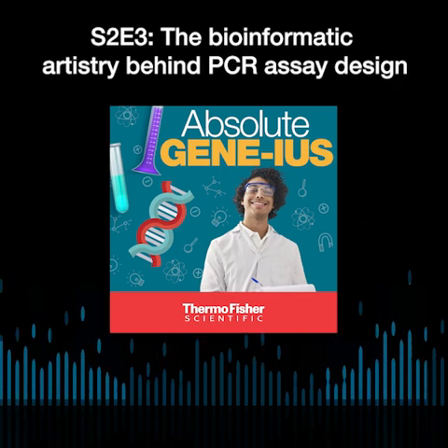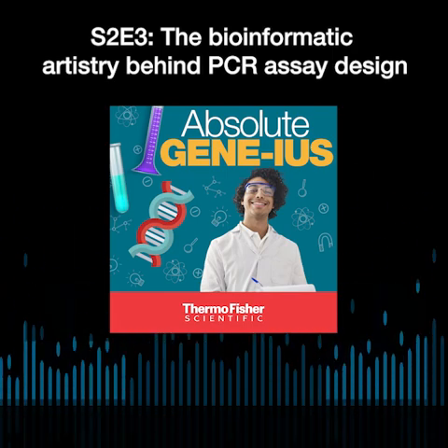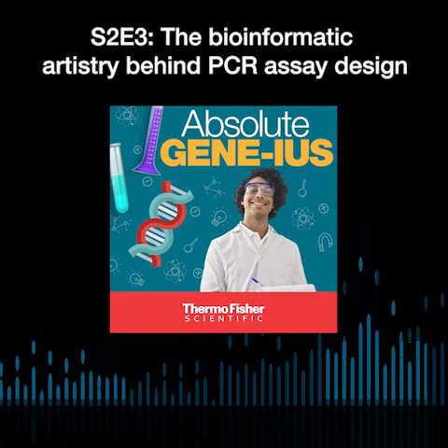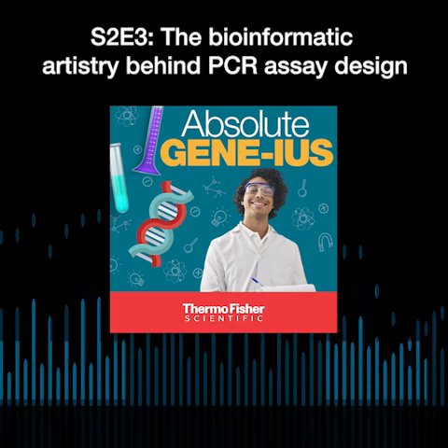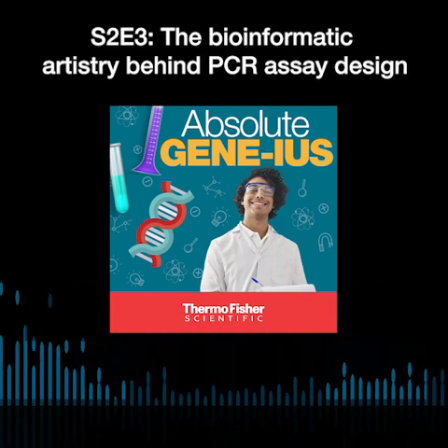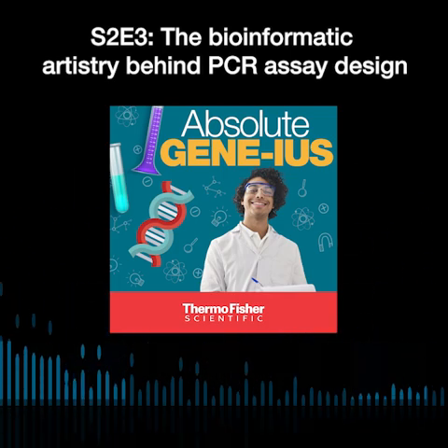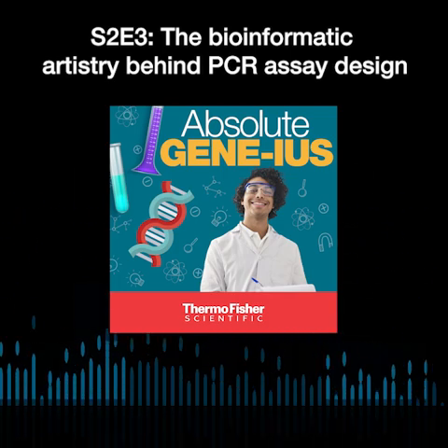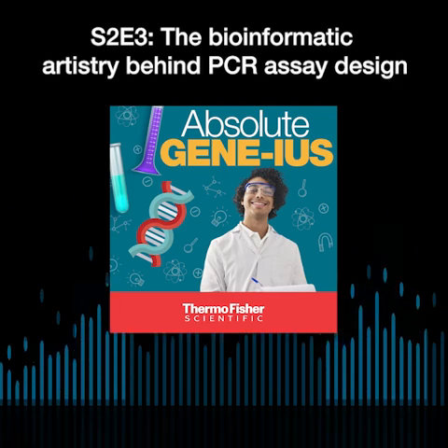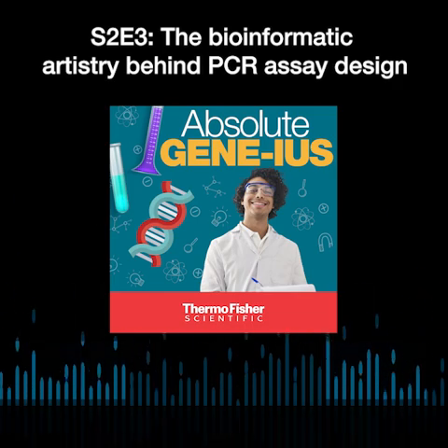I said, well, the results look like there might be mutant and wild type both in the sample. So then we took a step back and reanalyzed the targets, and we realized that actually these are not somatic mutations. These are mutations that are just general population-wide variation targets. And the control in which we were testing it actually had the population-wide variation. So what we were seeing was actually the ground truth.